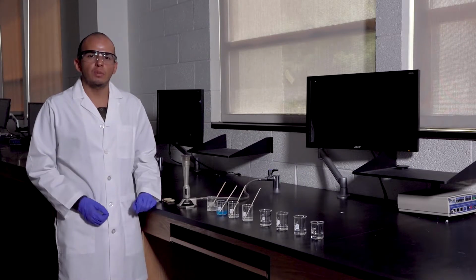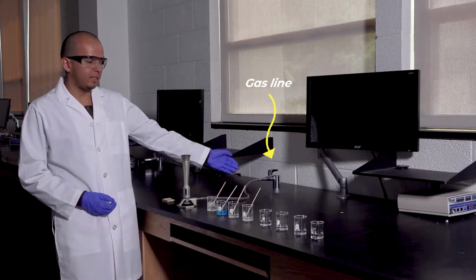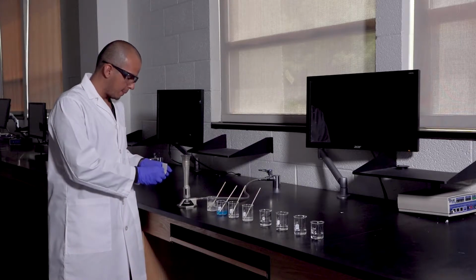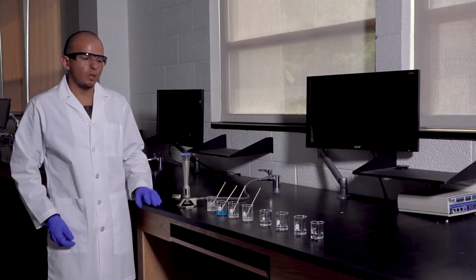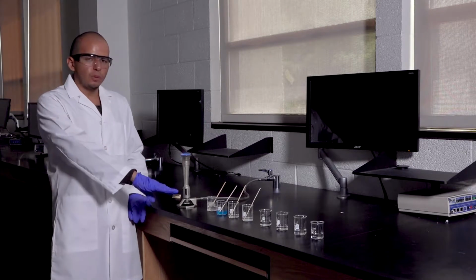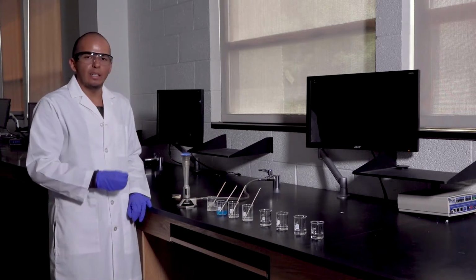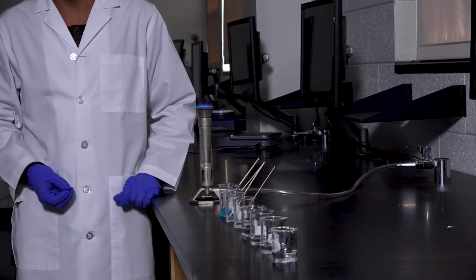So before we start the experiment, we should light the Bunsen burner. Before we do that, we have to open up the gas line that is connected to the Tygon tubing, and then we light the Bunsen burner with a match. After the Bunsen burner is lit, we can then test out the different chemicals that are displayed here. We're only going to test out 4 of them, which are calcium chloride, copper sulfate, barium chloride, and borax, to see what kind of color they emit, and I will let you try out the rest. So in order for us to see the colors, we're going to have to turn off the lights.